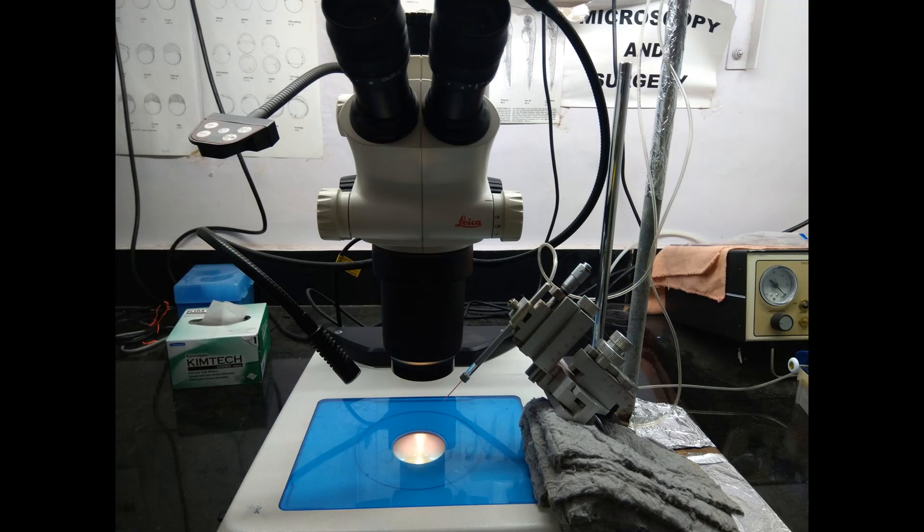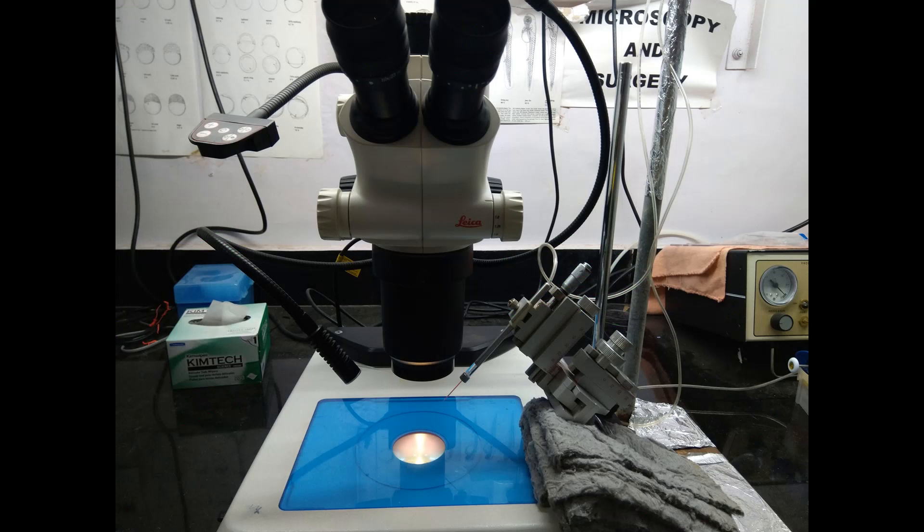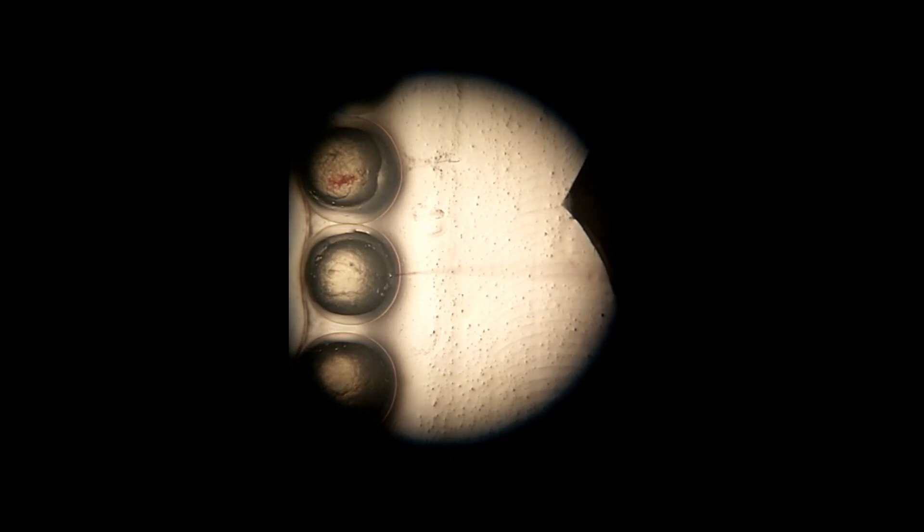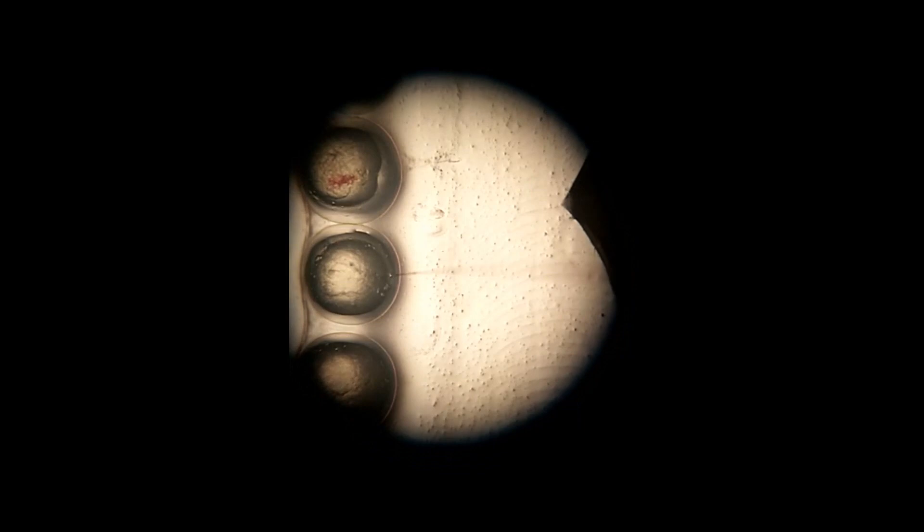This is the injector setup, and this fine needle is used to do injections. First, we break the needle and determine volume by measuring the size or diameter of the drop, and then we inject into the one-cell stage embryo in the yolk.